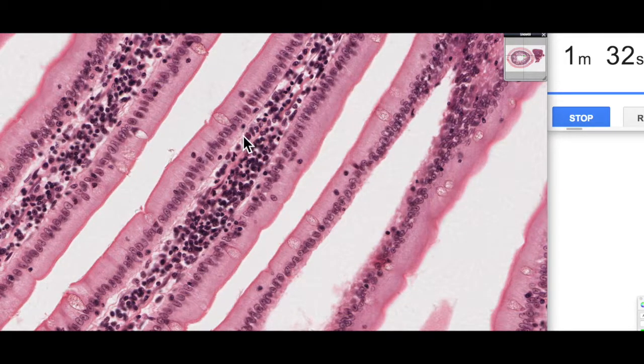If we have a look at this cell however, you can see it's got a very basophilic nucleus but its cytoplasm is also basophilic. So that would likely indicate that there's lots of rough endoplasmic reticulum or polyribosomes present and this is actually a plasma cell.